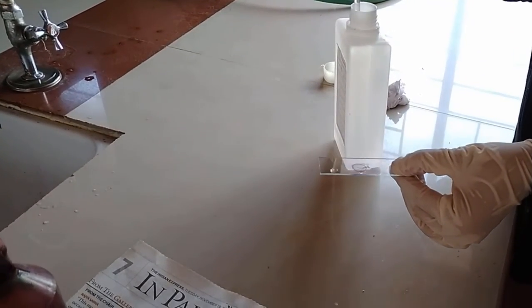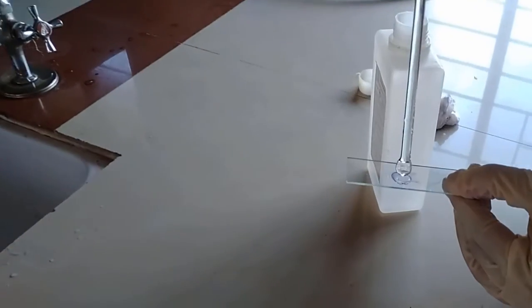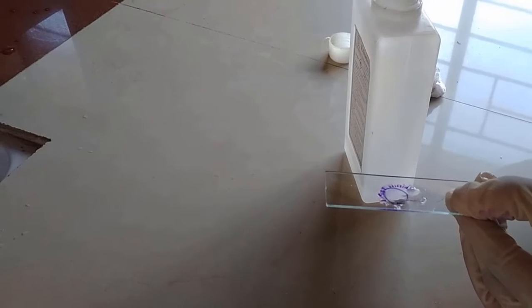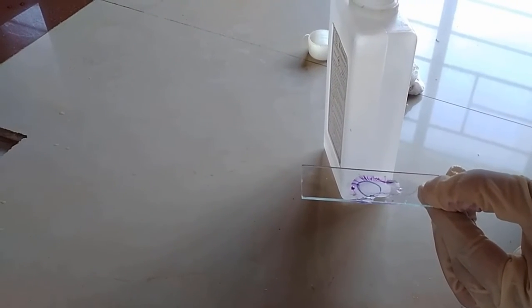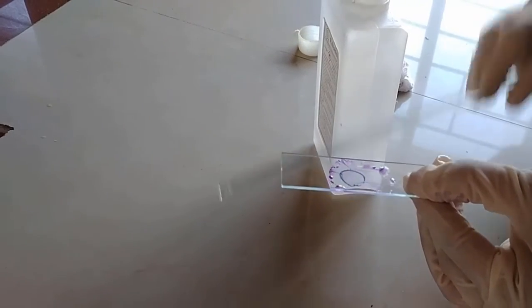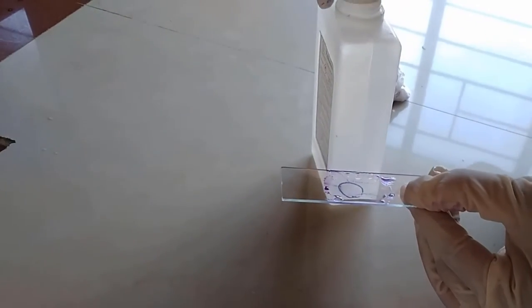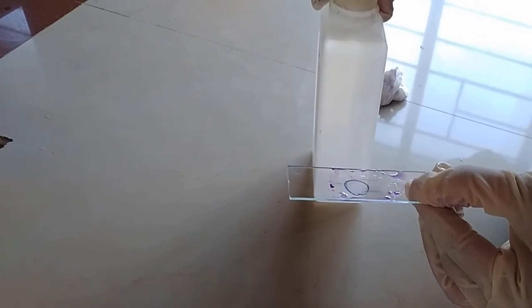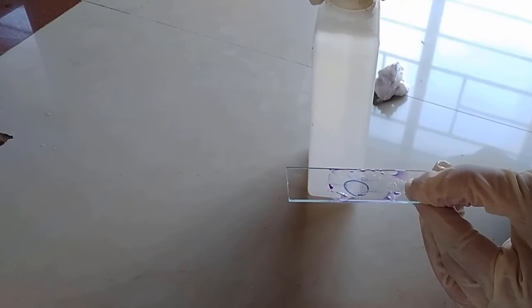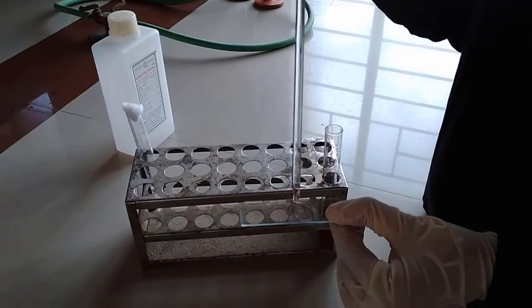Now we'll be adding alcohol, which acts as a decolorizing agent. 2 to 3 drops of alcohol on it. Keep it for 30 seconds and then wash it off. Then add safranin, 2 to 3 drops of this.